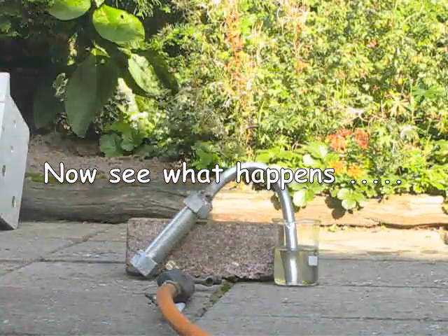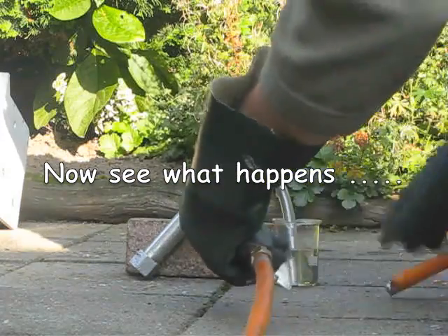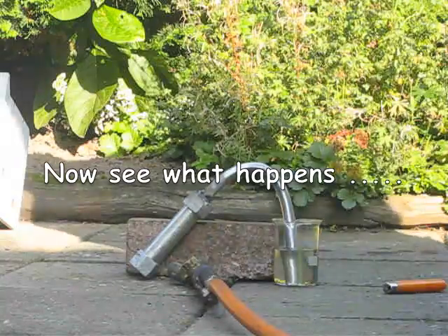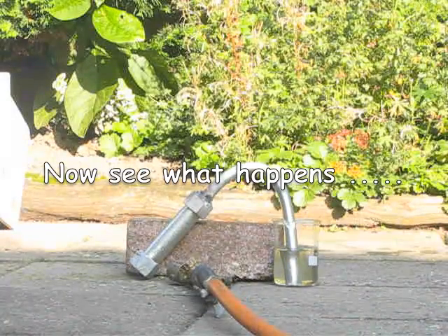Okay, let's get started. Let's turn on the burner and heat it up. Now I can wait until the reaction will take place.